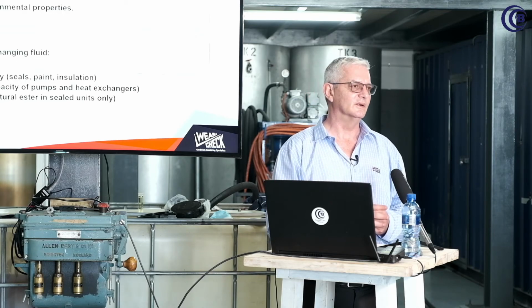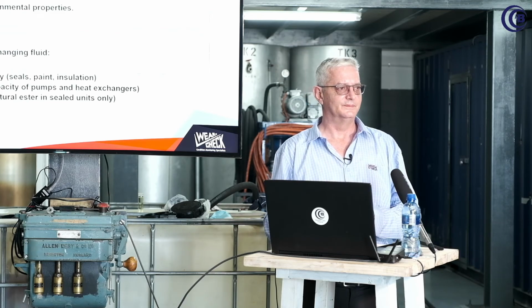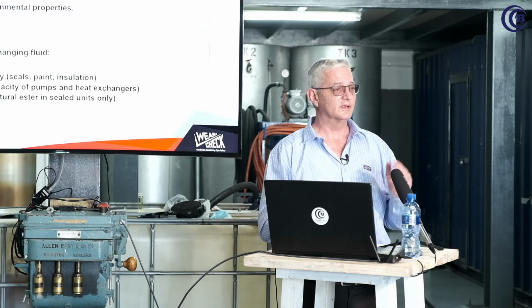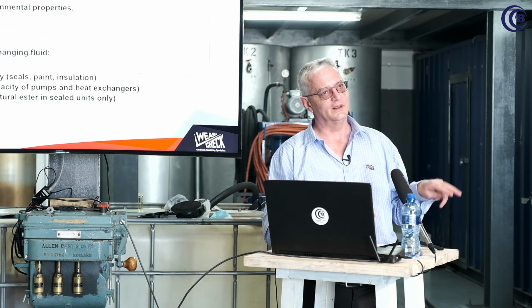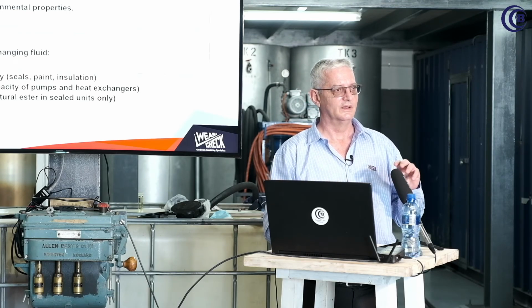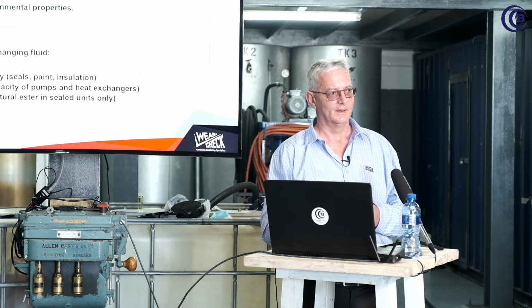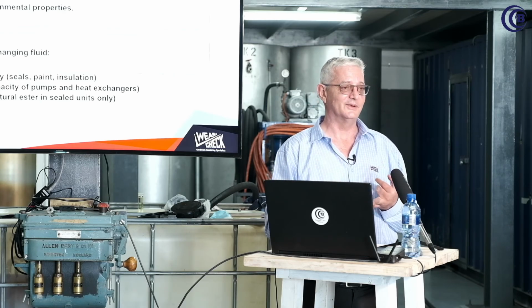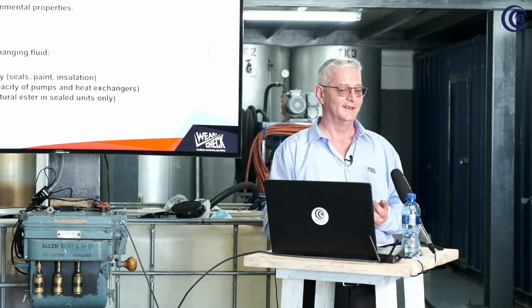Now we get to the silicones and the ester oils. Totally different type of oil, with their own specification. I've got one client in Port Elizabeth. He's got 6 transformers. 2 of each oil are in these transformers. So he's got 3 different oils in those 6 transformers. So now I have to diagnose it correctly. The guy taking a sample has to do it correctly. The guy going to do the repair work needs to know what oil is in there. It's becoming interesting.